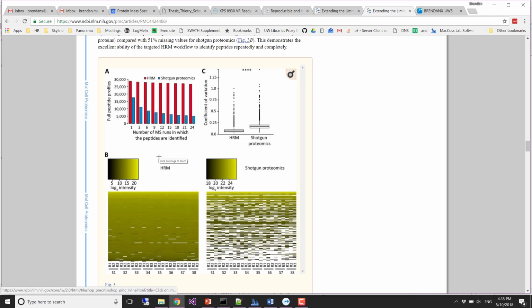So it's not quite as bad as, oh, in order to quantify this data we have to use imputation. We're not really using imputation because these aren't real missing values to the statistics, because we do alignment and we actually find these. So this was, I think, a little bit overstated. I still think it's a great story, and yes, you can get better quantification out of DIA, you can get lower limits of quantification, all these things, but this figure to me is a little bit overstating the point.